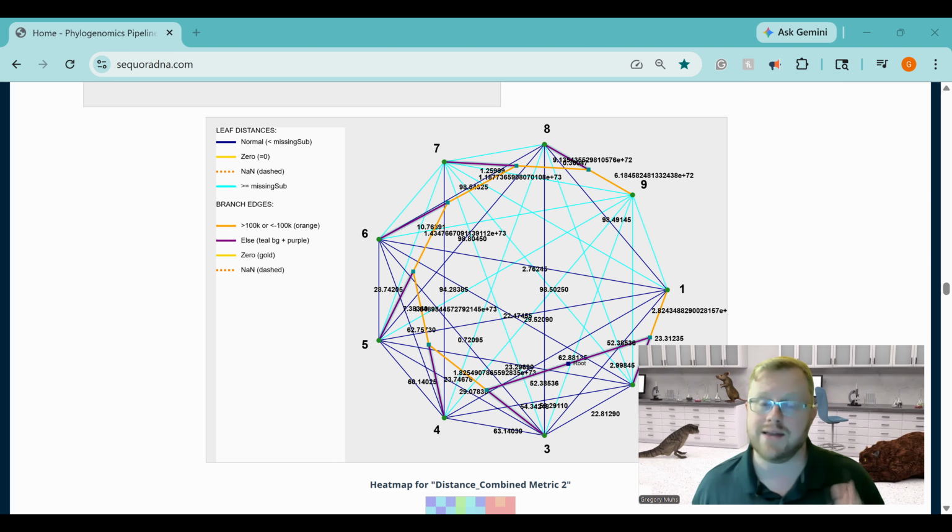That might mean that some of these genomes have that plasmid embedded into them and some of them don't. Or perhaps a part of that genome was taken by the plasmid and it overlaps with some genomes within that clade, within that group of genomes, but it doesn't overlap with others. And so a lot of questions are opened up.